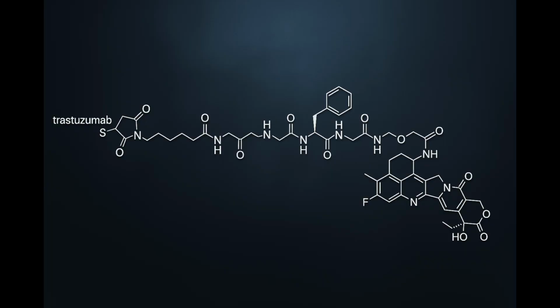The antibody is trastuzumab. The linker is MC-GGFG (Gly-Gly-Phe-Gly), which is cleavable, and the payload is a DX-8951 derivative, also known as DXD, which inhibits DNA topoisomerase 1. The conjugation takes place randomly via reduced interchain cysteines. In our build, the drug-to-antibody ratio, or DAR, is set to 8, which means we'll be using all 8 cysteines in the system.